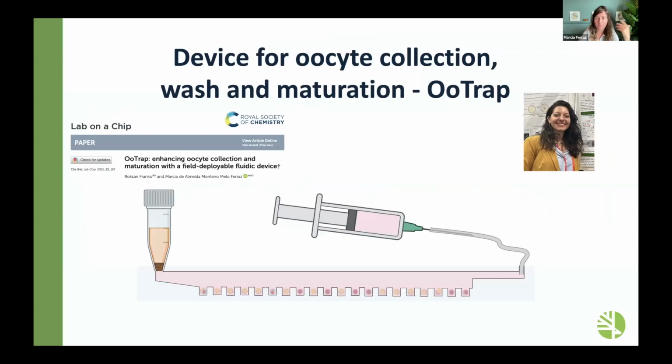So next I want to talk to you about the oocyte collection, wash, and maturation. That was the work done by Roxanne, a PhD student in the lab. It was recently published in Lab on a Chip.